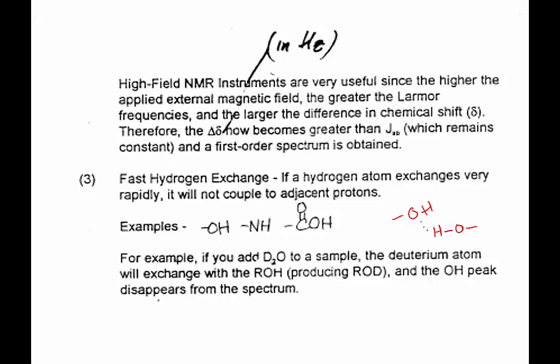Well, the same thing would be true for molecules with NHs, and the same thing would be true for the carboxylic acids. They're going to be constantly hydrogen bonding with other molecules. Well, when the alcohols hydrogen bond and they break apart, does the hydrogen always stay with the same alcohol molecule? No, they can be swapped back and forth, or a better word is exchanged.